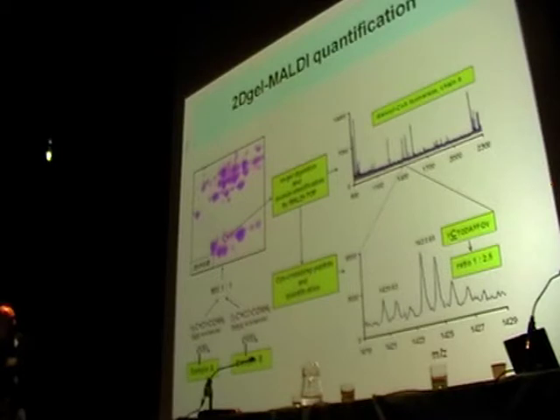We modify cysteine residues because of alkylation with a double bond, in sample A with light compound, in sample B with heavy compound, and mix them at a 1:1 ratio. It's based on total protein, like 10 milligrams of total protein from one sample and 10 milligrams from another.